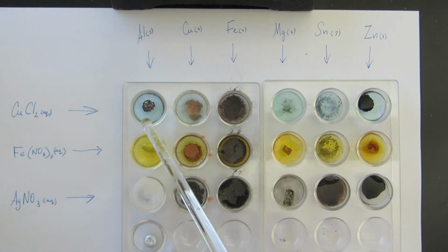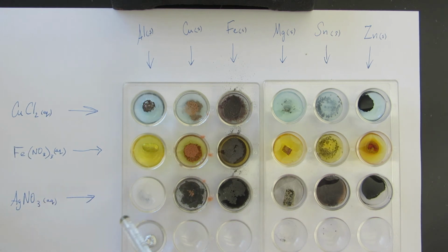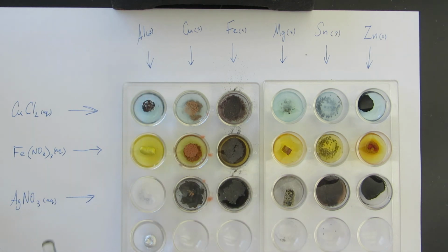All right, clearly the aluminum is reacting, so that would tell us that the aluminum is more reactive than copper. I see some bubbles, so it might be hard for you to see. I just moved the bubbles out of the way. Anyway, there's bubbles forming, so we're forming a gas. So aluminum looks like it's going to be more reactive than iron. We can just give that a little more time before I shut this off. And then down here, dang it, I rinsed it with just a littlest bit of tap water, and I precipitated some more stuff.